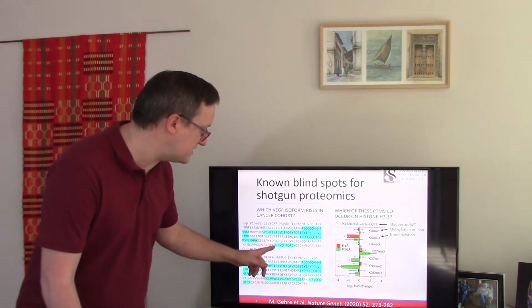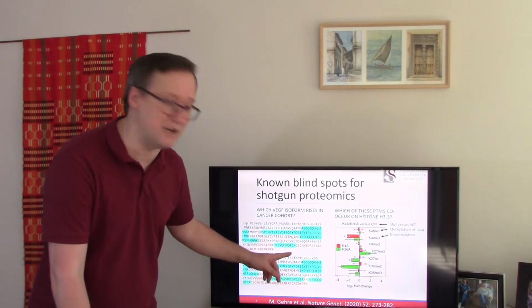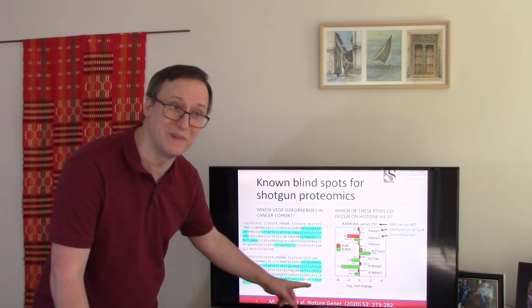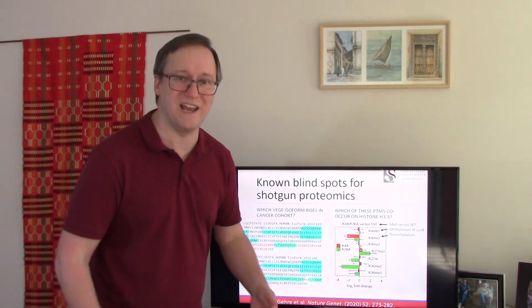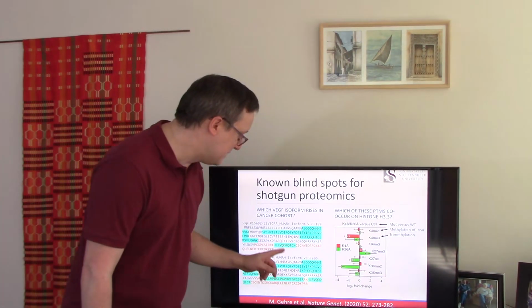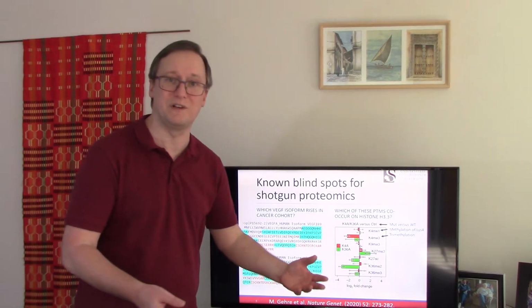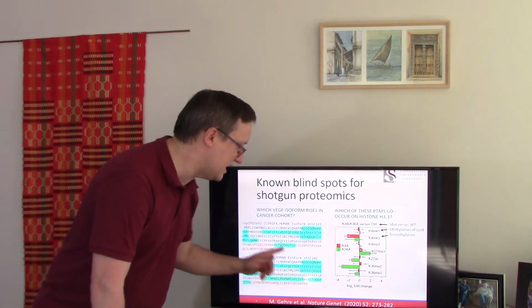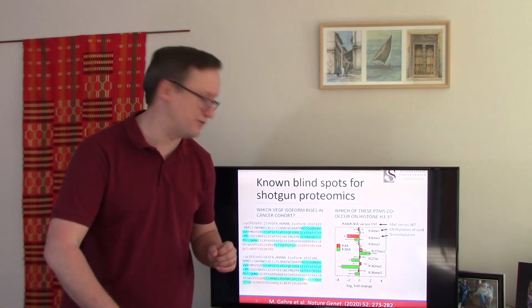But I note that this HLF peptide that we were so excited about just a moment ago also appears in this other isoform. In other words, we have an extra exon getting inserted into the sequence, but this HLF one, even though it's in this region of difference, is just moved later into the sequence. So HLF does not, in fact, differentiate these two isoforms.